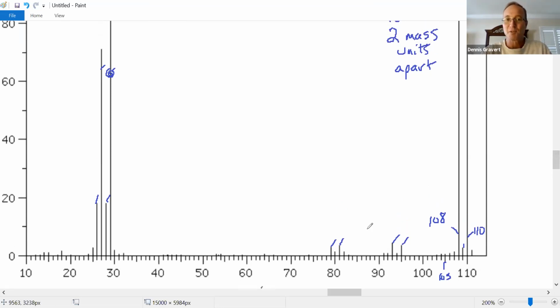What's the weight of bromine? 79 and 81. This one at 20 something, they can't have bromine. Silly me. So, okay, this is a good example where I see a pattern, tried to apply it, and then I checked it and it doesn't work.